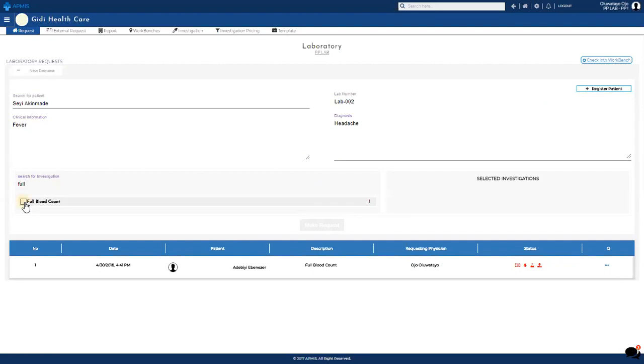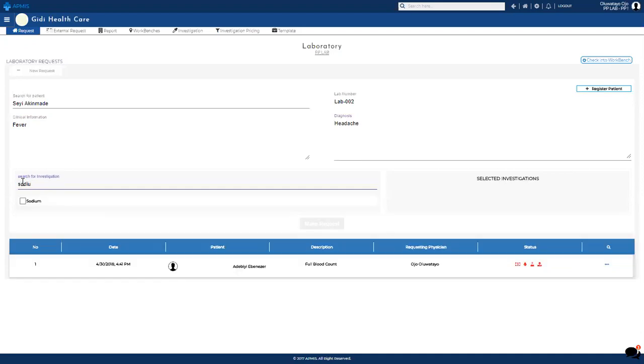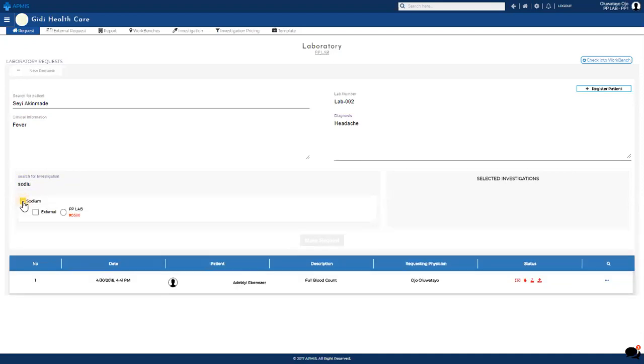Remember, this full blood count is being added in our investigation list. So anything we search here is searching from our investigation list. If I should search for sodium, yeah, it brings sodium. So I want you to take note of something.